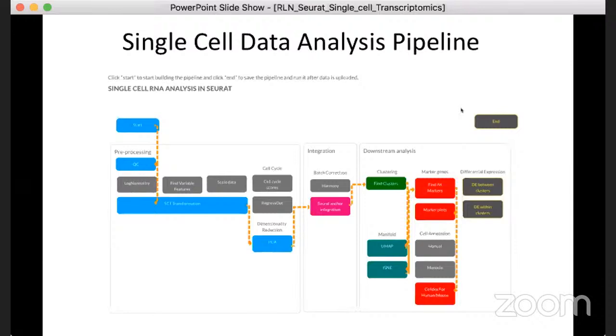And then what follows, after this visualization, is that we have to perform clustering. In clustering of cells, we will identify and find different clusters. And the goal in clustering, as you have already been introduced to, is to place similar cells together in a very low dimensional space.